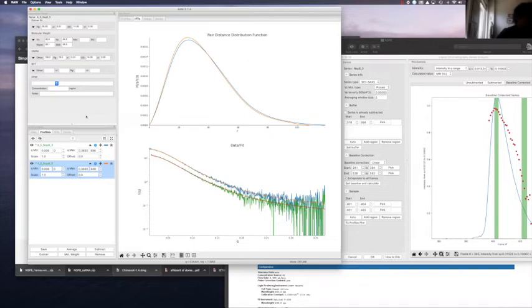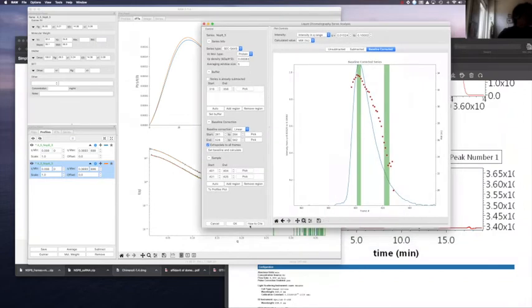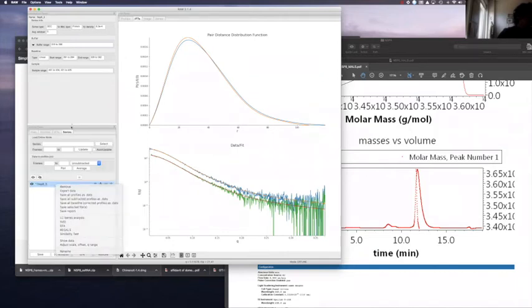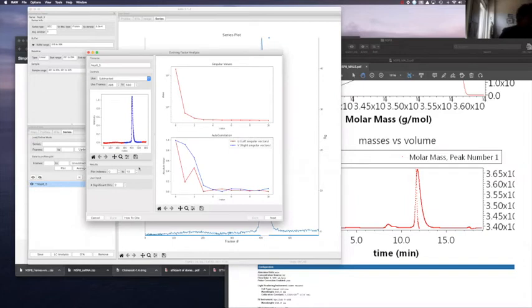So if you go back to your analysis and you decide to do something more fancy, okay, we just click OK here, we don't need this now. But when you go again to the series, it's right here. Again, you have options of SVD or EFA. The EFA was mentioned today as a tool when you want to deconvolve, and we do SVD at the beginning and immediately recognize there are two components.